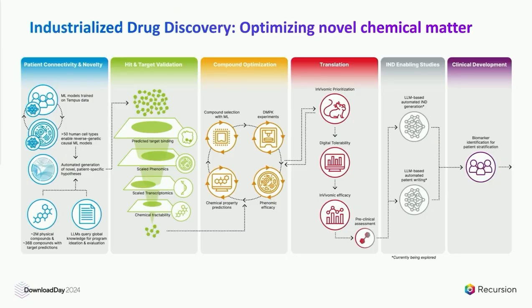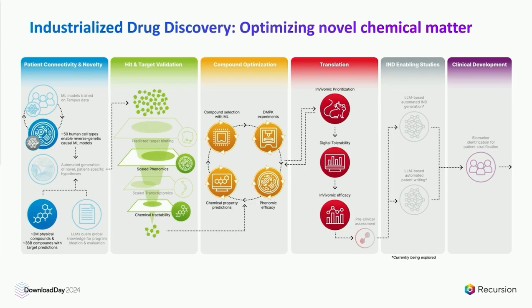So now, Lena shared with you our industrialized drug discovery process. Again, this was an early program, and so we only used a subset of the modules for this program, but you can see hopefully how we use a single assay like Phenomics to be able to drive a lot of the core questions that we have in drug discovery.